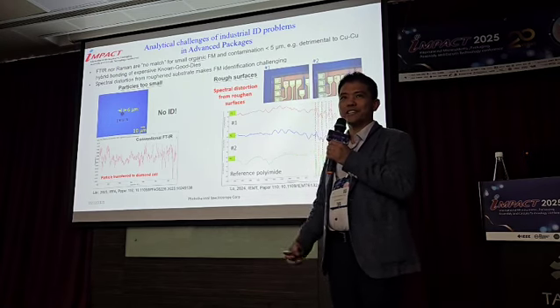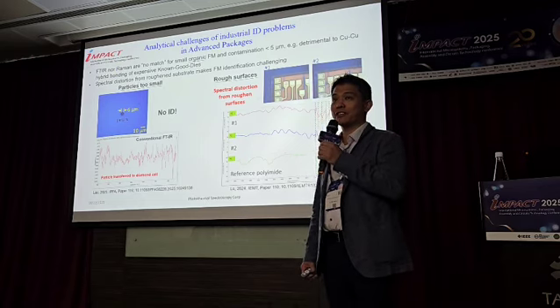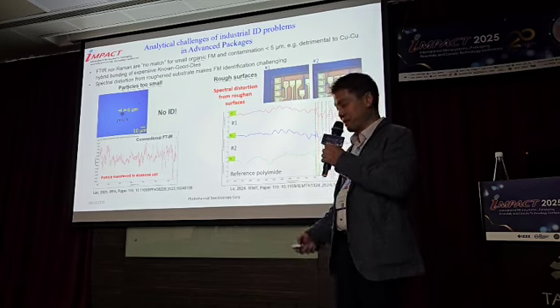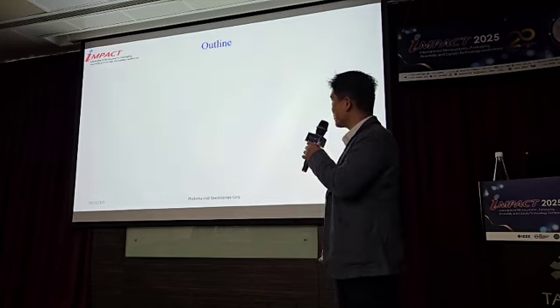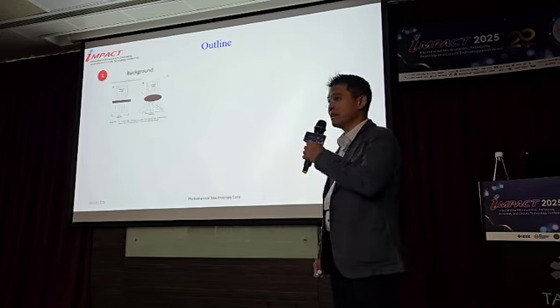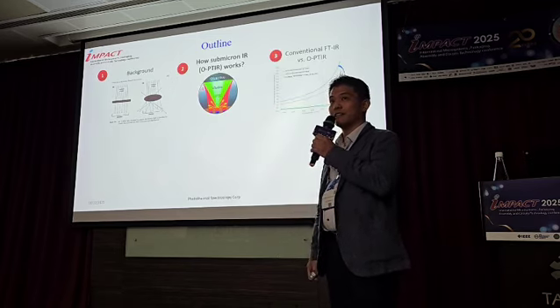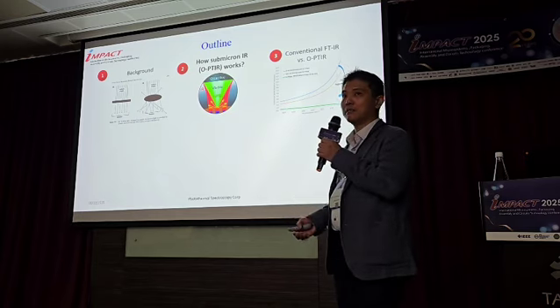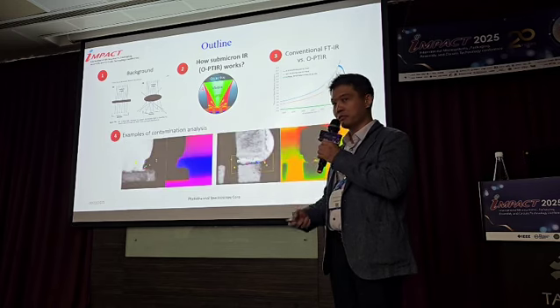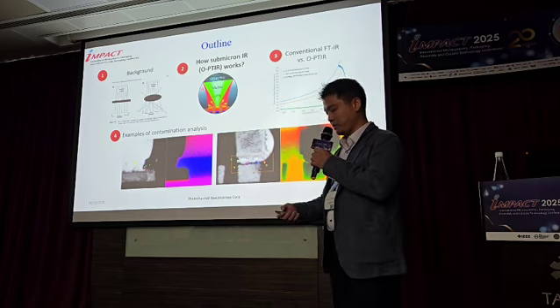But in recent times, things have changed a little bit, and I want to share how we can actually go about analyzing these small contaminations using infrared spectroscopy. But I do have to go through a little bit about how it actually works. First, I'll tell you a little bit of background about infrared spectroscopy to begin with, and then follow that with how submicron IR, or OPTIR, works. And then follow up with a couple of examples showing how it actually works.